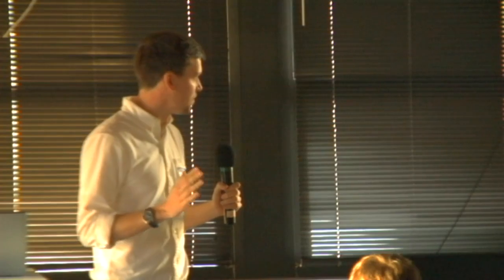And one real advantage of doing all of this by hand, custom for ourselves, is that we could standardize the API across all of the instruments that we're talking to. So we came up with a really simple scheme that really just has 3 basic parts.